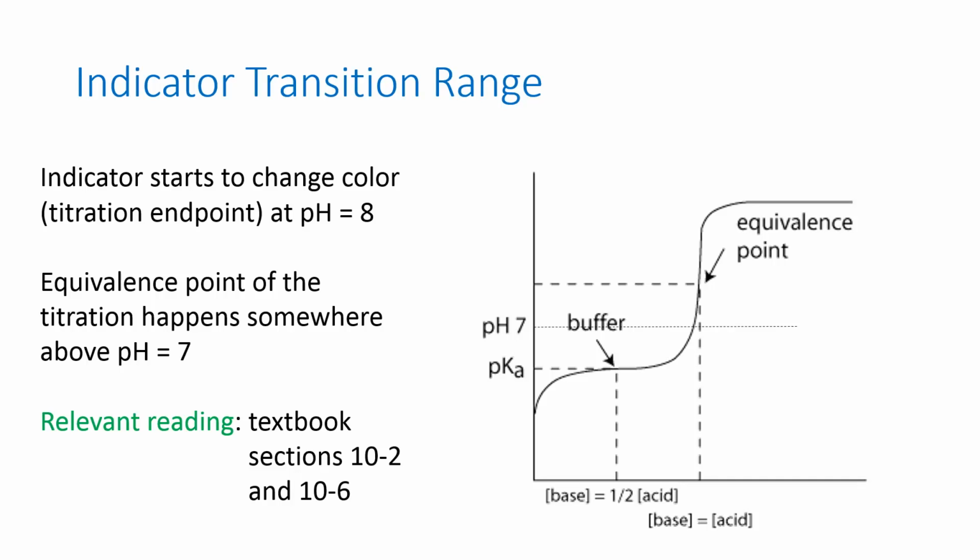So at the equivalence point of our titration, we will have added an equal number of sodium hydroxide moles as there were moles of KHP in the flask. Mathematically, that's the equivalence point. Visually, what we see is the end point, and the difference between them is called the titration error. What we want is an indicator that minimizes the titration error.